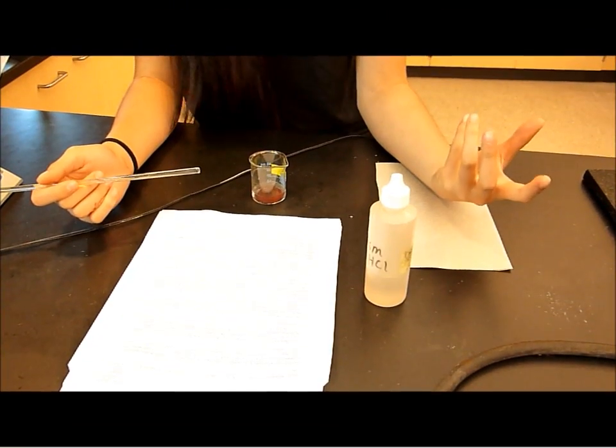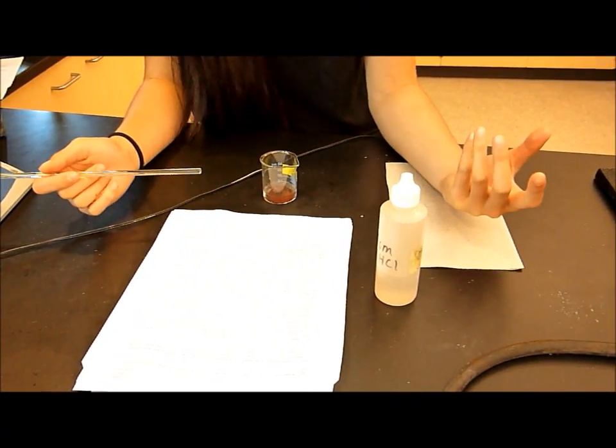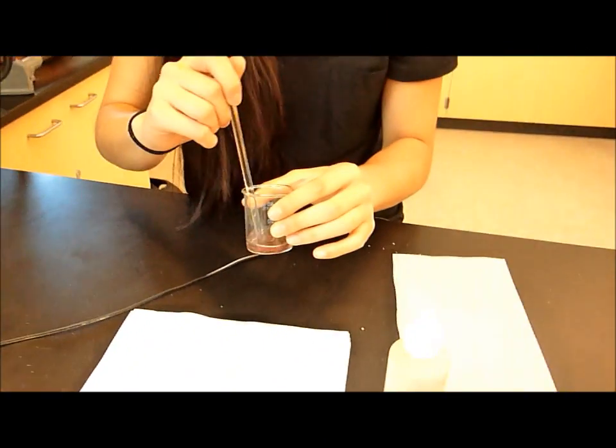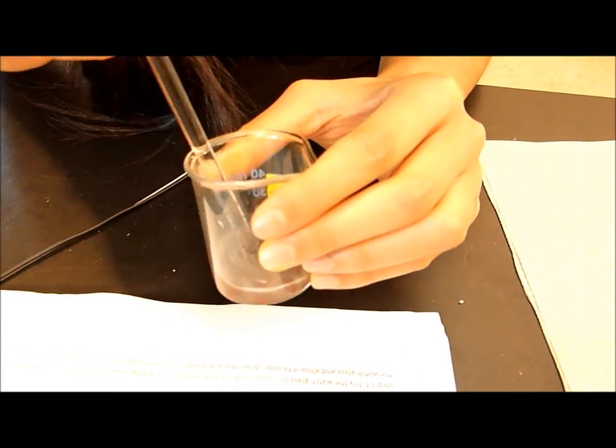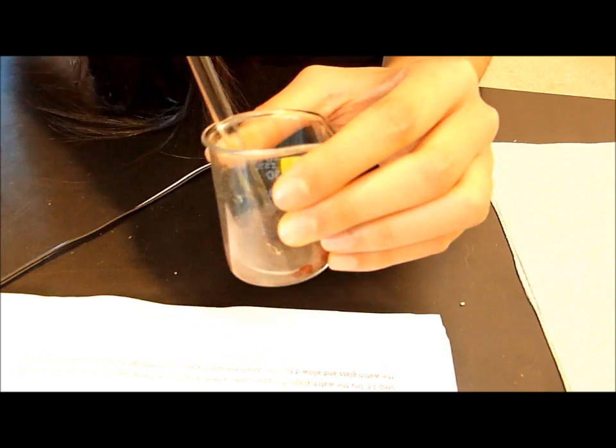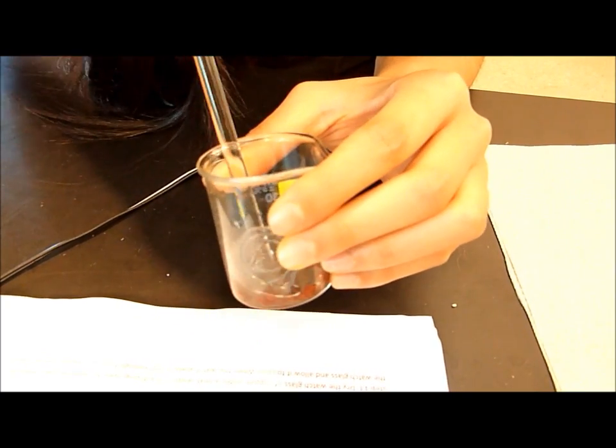Use a glass stirring rod to scrape off as much copper as possible from the aluminum wire. And then, when you're done, slide the wire up the wall of the beaker and out of the solution with the glass stirring rod.